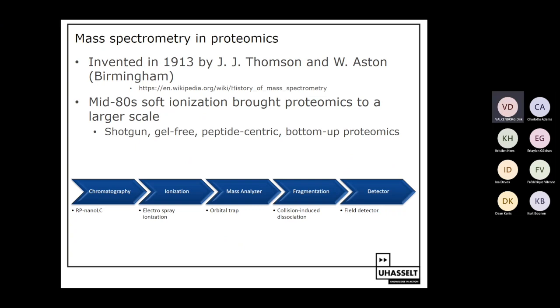And in the beginning years, mass spectrometry was not really used to analyze proteins because proteins are way too big molecules to be ionized, because we needed to ionize our molecules before we can analyze them with mass spectrometry. And mass spectrometry was therefore more the play field of the people that were investigating atoms or metals, heavy metals, for example. And that's exactly what J.J. Thomson was doing.